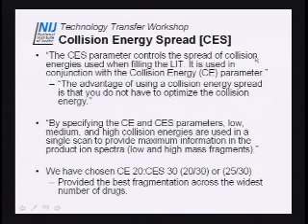We've chosen 20 plus or minus 30. You can see, or 25 plus or minus 30. What we did there, we had an instrument that just needed a little bit more gas, I mean, not gas pressure, I mean like pedal to the metal. You need just a little bit more voltage to get a little bit more fragmentation so that it better matched the library. That's how we tweaked it in our lab.